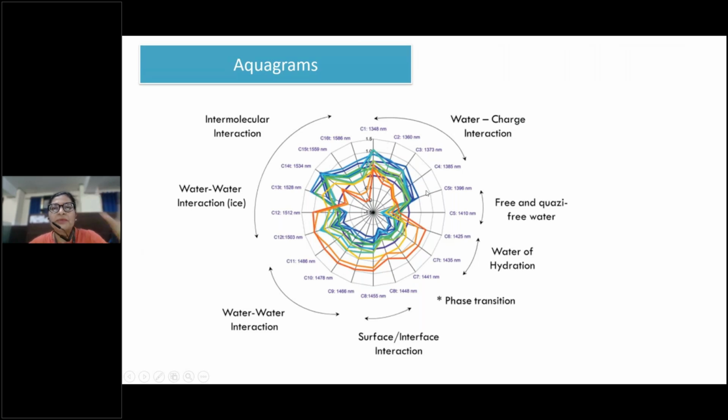It is in the vapor stage. If it is in this region, it means it is a bit tightly bound, water vapor transitions. And here it is something like water and then going towards ice. So from this 1300 point to 1600 point, you observe 6 transitions.